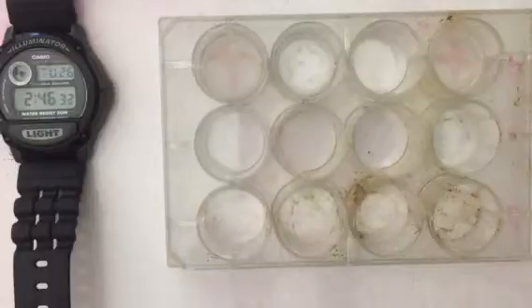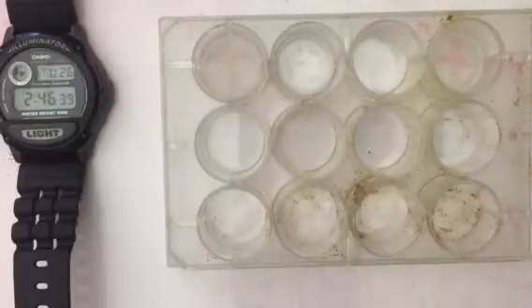So here's your question for you. What happens if we have different concentrations of thiosulfate? Do the experiment. What happens if we try and find a catalyst? Does acid act as a catalyst? Do the experiment. Would copper act as a catalyst? Try the experiment. What if we heat it up or cool it down? Design the experiment. Again, it's dropwise.